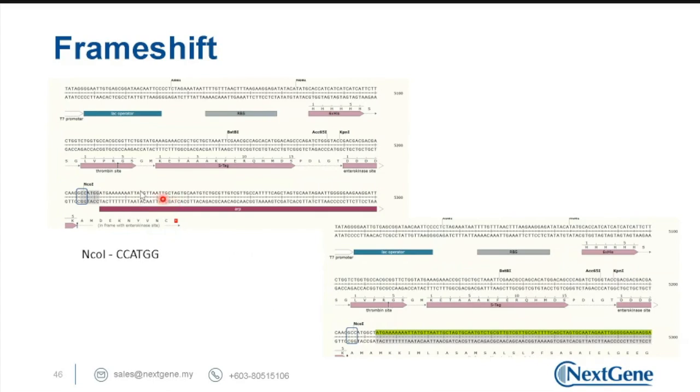In this particular example, the NcoI is actually CCATGG. NcoI is the highlighted area, CCATGG.